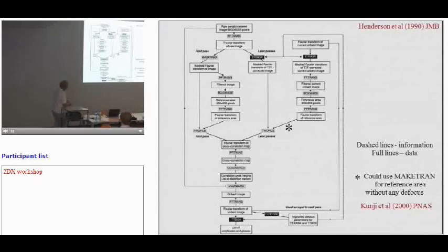So you then read off in that Fourier transform the amplitudes and phases, and that bottom pattern here was merging them into, let's say, a projection pattern. And then in this paper, we were dealing with what happens when you tilt. You take tilted images, where the contrast transfer function is varying as you go across the micrograph, possibly by a micron of defocus. It might be 1 micron defocus at one edge and 2 microns at the other edge.